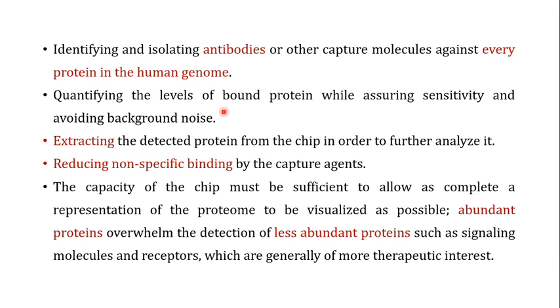Another challenge is that during the protein microarray analysis, quantifying the levels of the bound proteins while ensuring sensitivity and avoiding background noise. The synthesis of the proteins and their extraction in pure form is a very laborious process, and once you immobilize them on the chip and go for a particular detection, those proteins usually denature and you cannot reuse them.